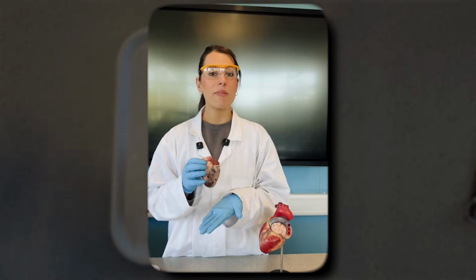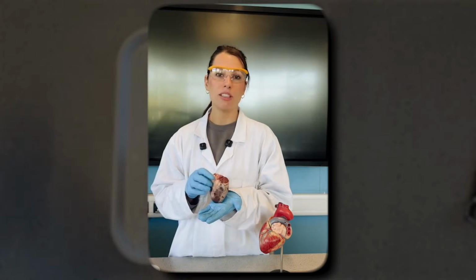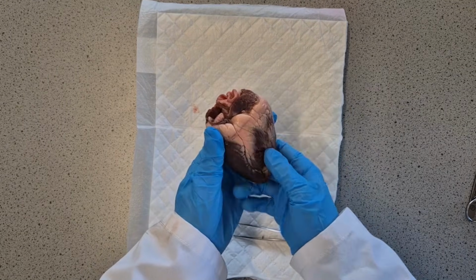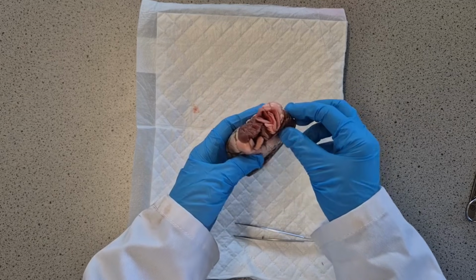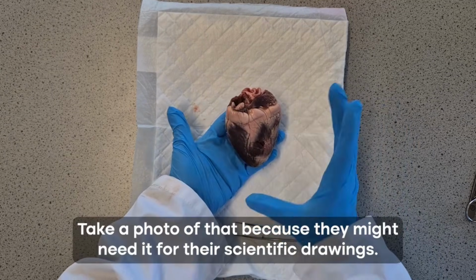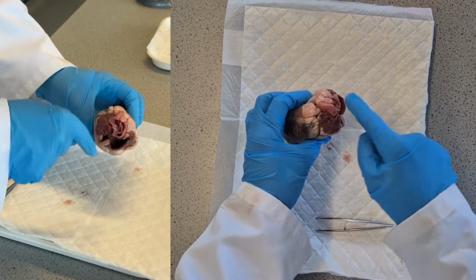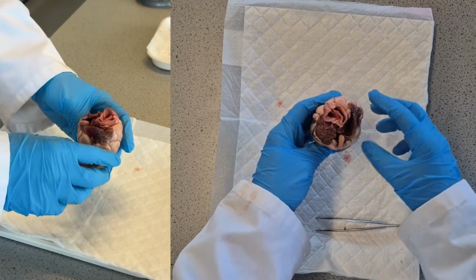Watch along for all the key information that you need to know for your A-Level Biology students. After the students have had a look at the outside of the heart, they would have already identified the atria, coronary arteries. I'd get them to take a photo of that because they might need that for their scientific drawings, as well as taking a photo from this angle so they can see the blood vessels as well.